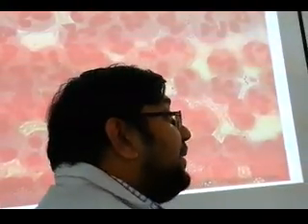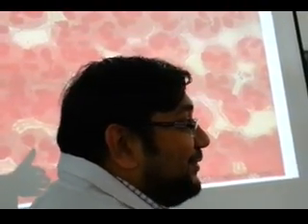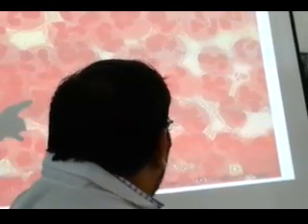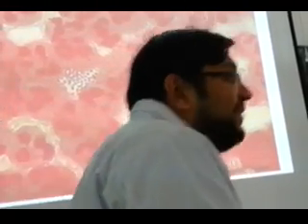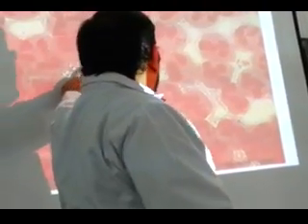White blood cells, okay? They can have a multi-lobed nucleus, you see so clearly. Right? So this is not bacteria. Bacteria is this small thing here. Okay? Don't get confused if I put it like this, this is bacteria.